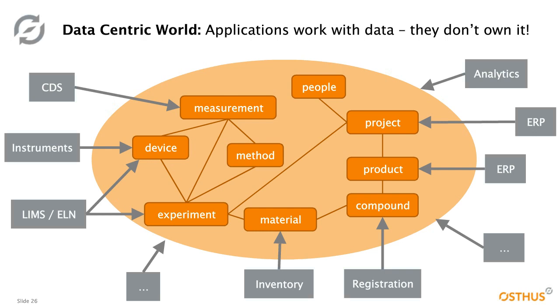Eric, yeah, I'll start with this. First of all, Paul, you're 100% correct. Making people enter pages full of metadata to enter their regular data is not going to work. People simply ignore the systems, or they just put in the date timestamp and the machine they're using in the lab or something like that. They ignore a lot of the other things. So you don't want to overly burden your scientists with having to add in all this metadata.